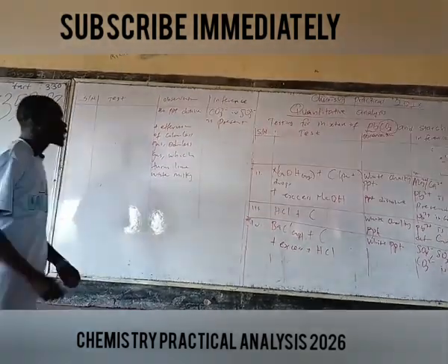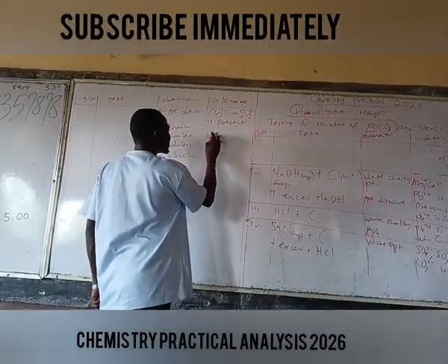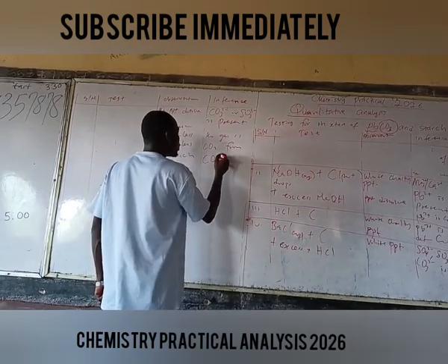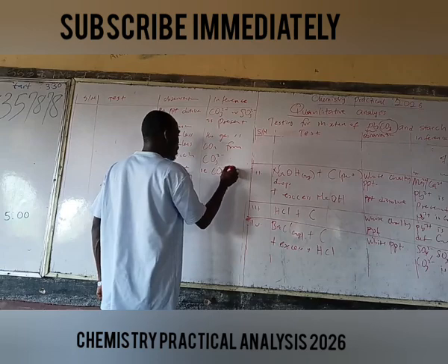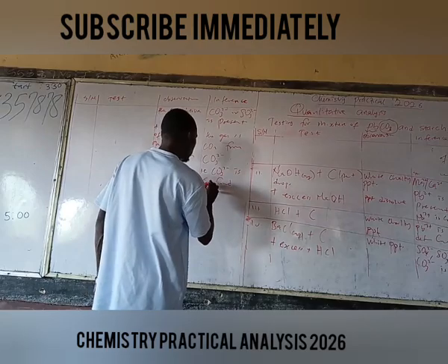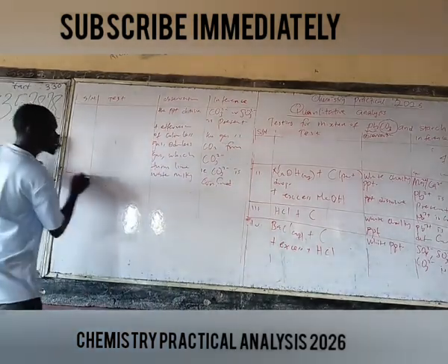Now we already know that the gas is carbon IV oxide from CO3 2 minus. Therefore, CO3 2 minus is confirmed.